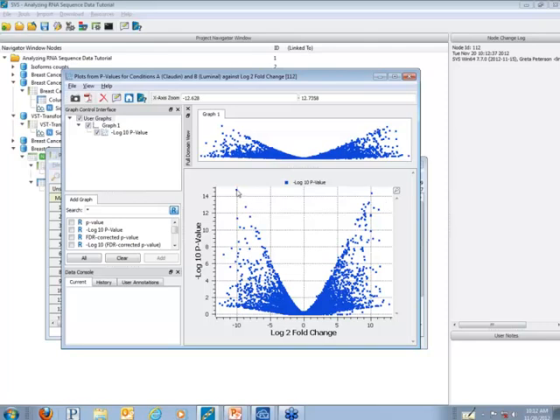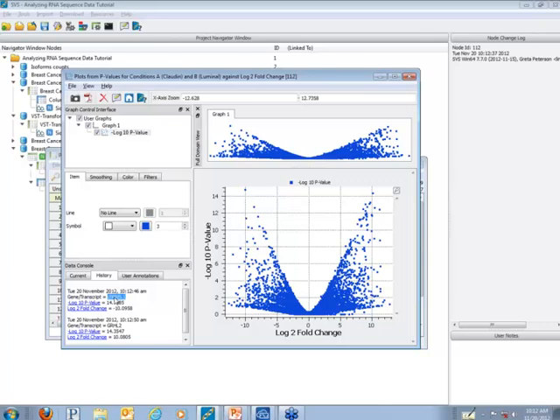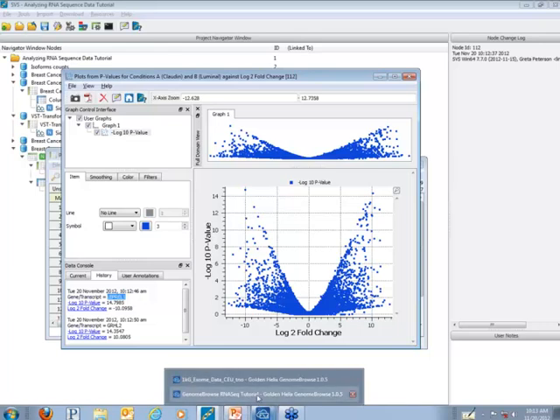Click on the top gene on the left, and that's the LEPROL1, and the top gene on the right, and that's the GRHL2. Now we'll go over to our History tab. I'm going to double-click on this gene name and copy that. Now I'm going to jump over to Genome Browse.